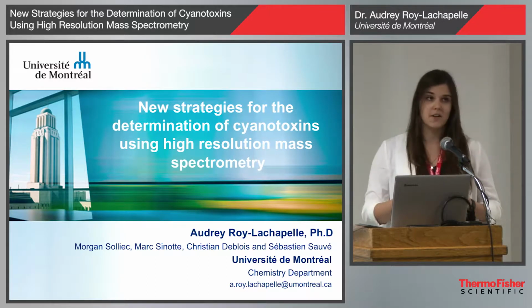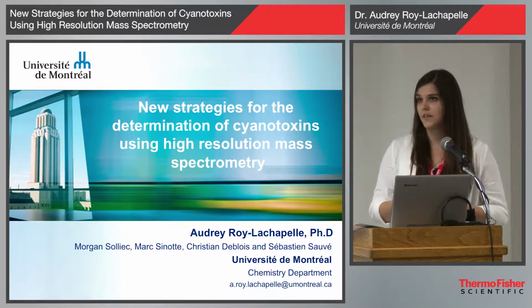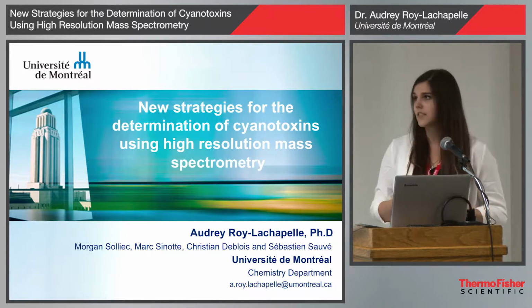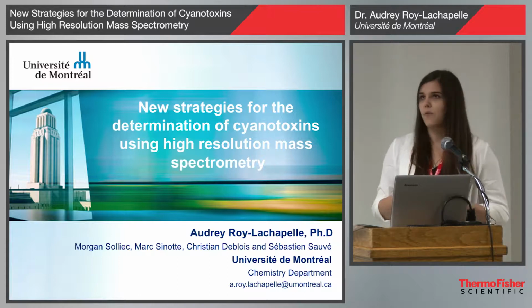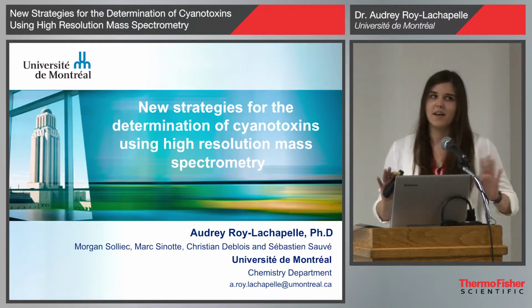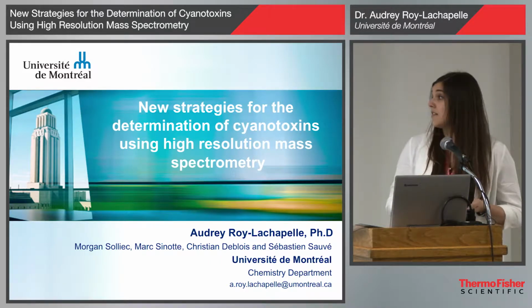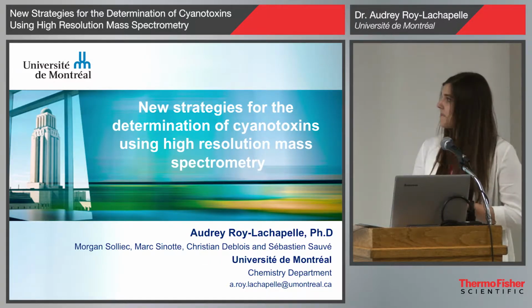I will present you a part of the work that we are doing on a large-scale project about the monitoring and prevention of cyanobacterial blooms and toxins through genomics. I won't talk about genomics here, it's more about the toxin analysis, and it uses high-resolution mass spectrometry.